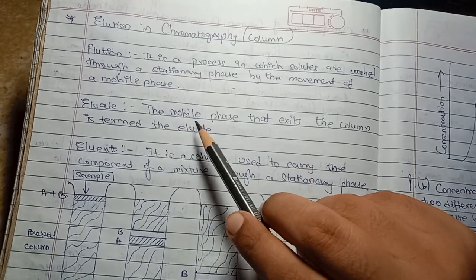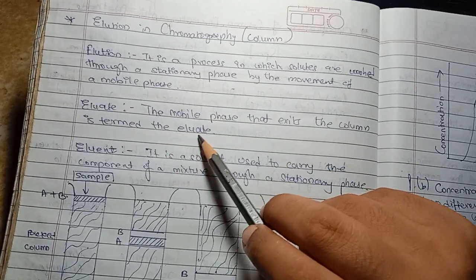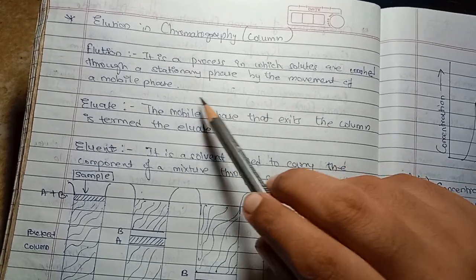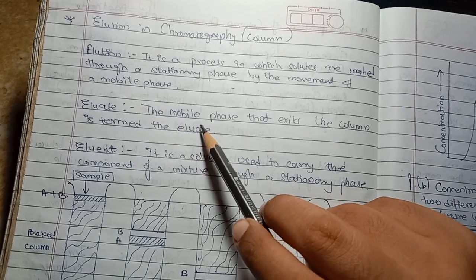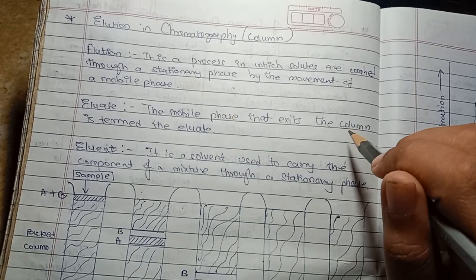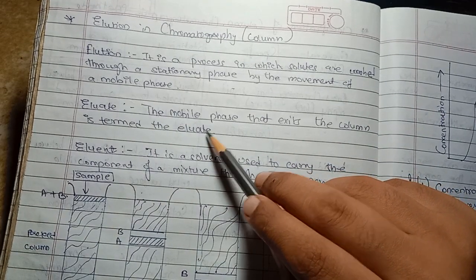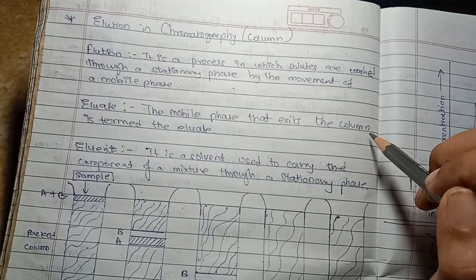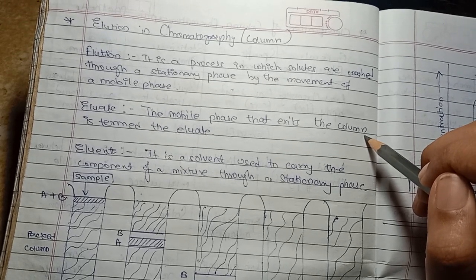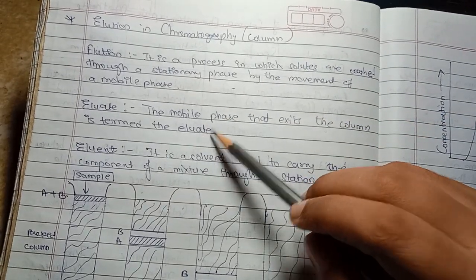Okay, now what is eluate? The mobile phase that exits the column is termed the eluate. So whichever mobile phase leaves the column, which is the stationary phase, is termed eluate. Whenever the mobile phase leaves the column stationary phase, which is in solid form or liquid form, when the mobile phase moves out of the column, it is termed eluate.